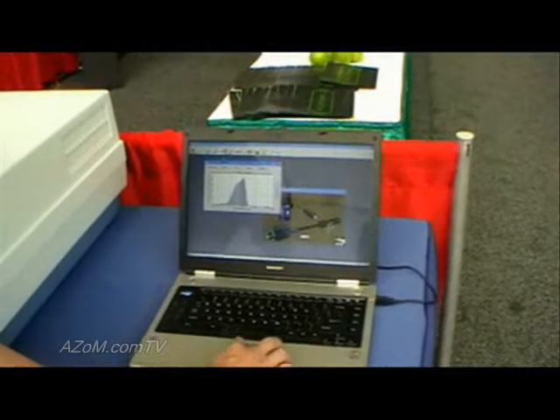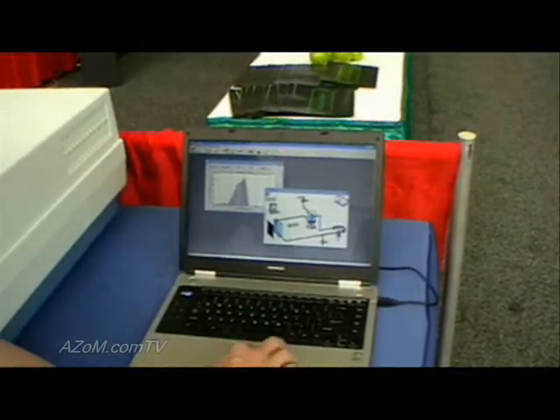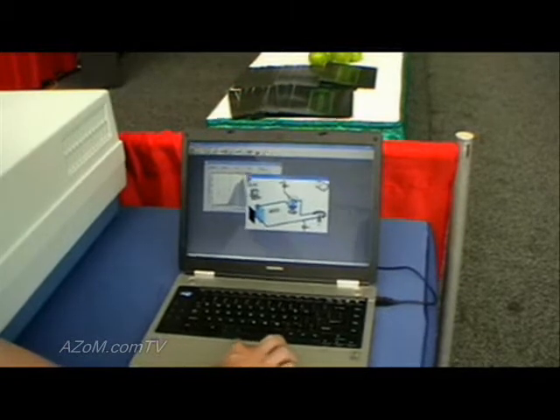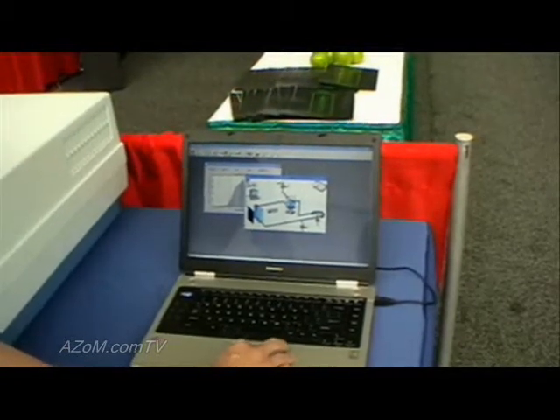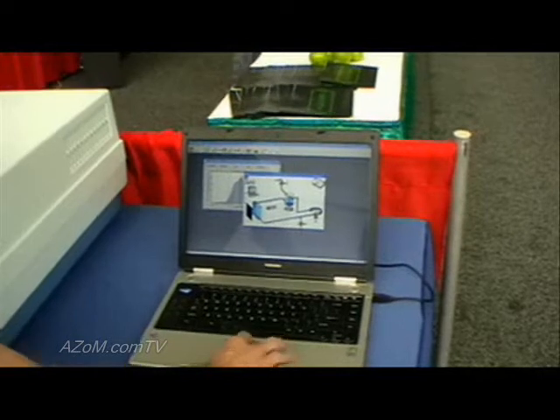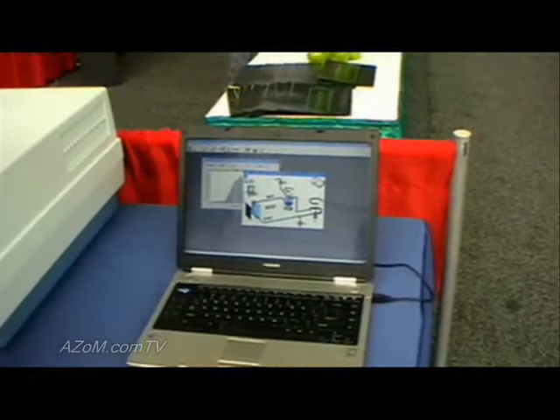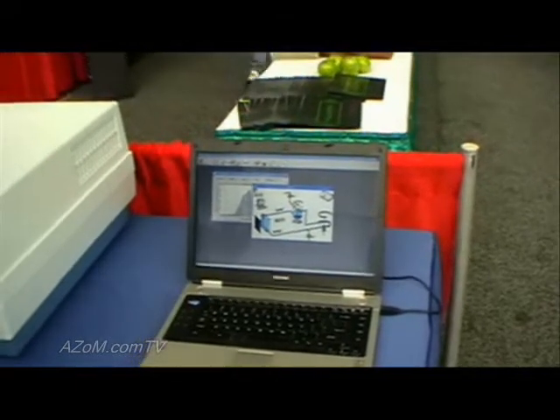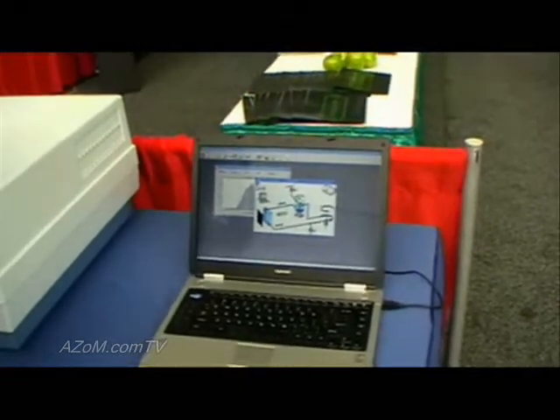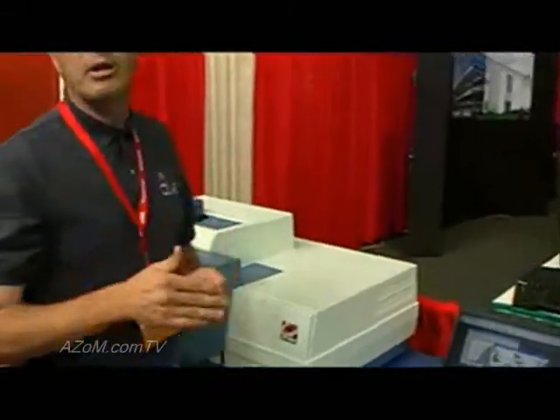What's also nice about the Silas software — going back to wet dispersion — all the functionality of the instrument is controlled through a WYSIWYG display. We can circulate the sample and get a particle size distribution. For quality control aspects, we can set pass-fail criteria, so the software will automatically flag your system if it is out of process.